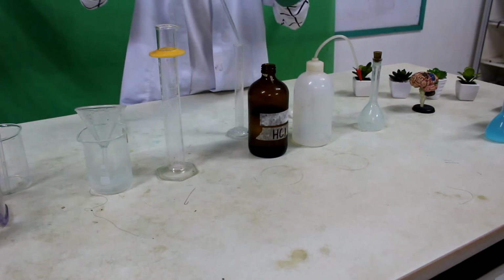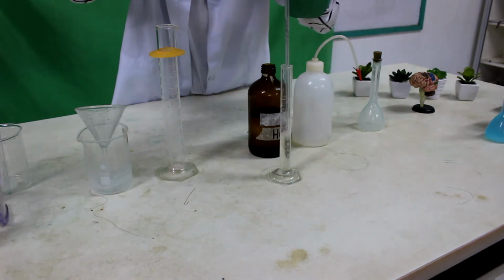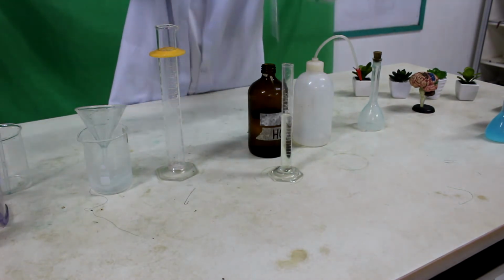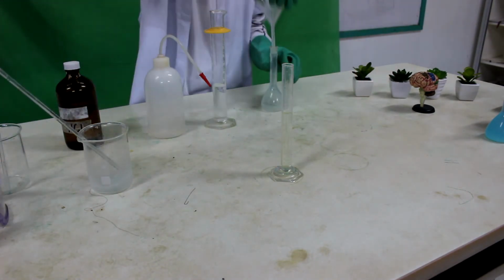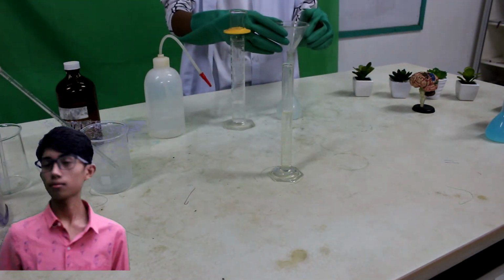Preparing a hydrochloric acid or a hydrogen chloride solution. We need to use a pipette to extract the 20 ml of HCl. Pour a little amount of water first before adding the HCl.